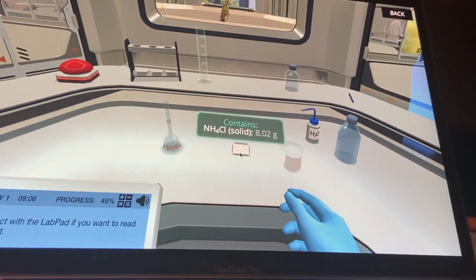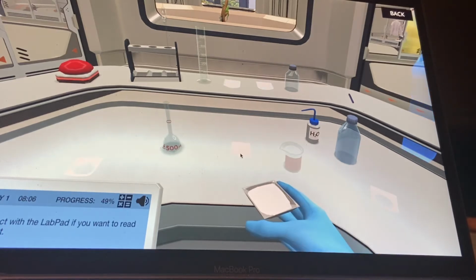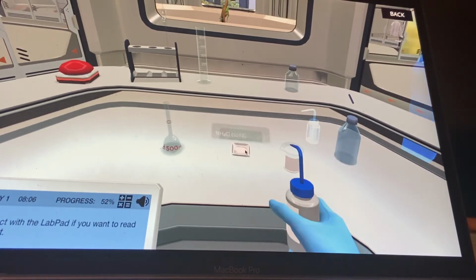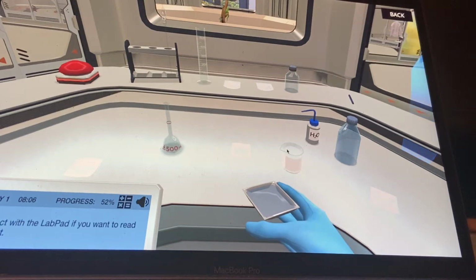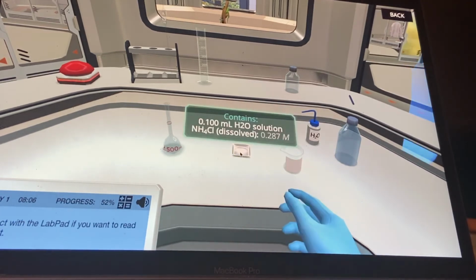It can be really difficult to get the salt directly from the weighing dish into the volumetric flask. So we'll first add it to a beaker. I created a new one for you here on the workbench you can use. Nice. As a bit of the salt can easily be left in the weighing dish, to make sure we transfer everything, also called to transfer quantitatively, you need to wash the weighing dish with the solvent of the solution you're making, and also transfer this to the beaker.